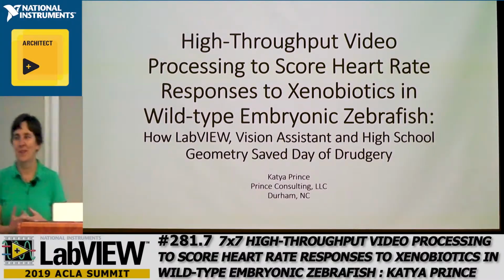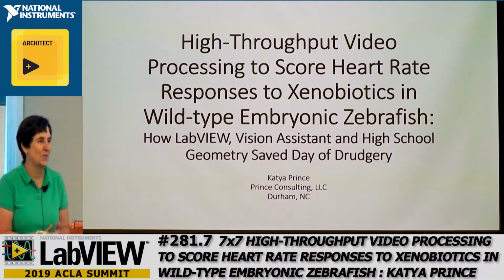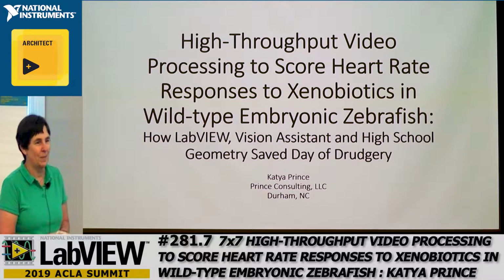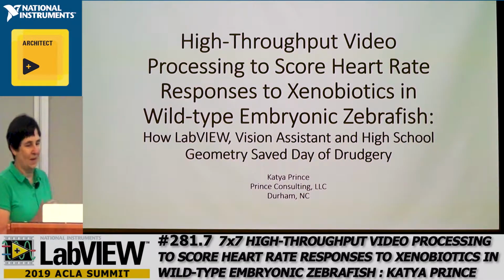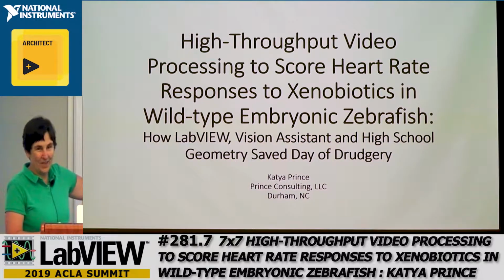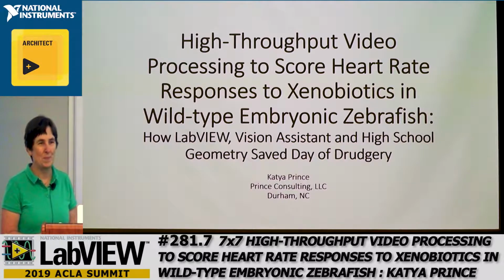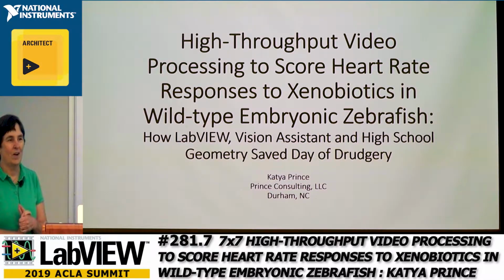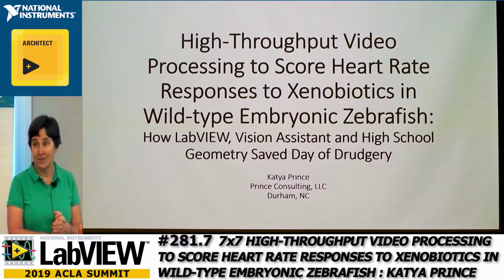Okay, so this is going to be something completely different from everything that we heard. This is actually going to be another example application that I put together. I work for the EPA from the toxicology department. This is a big, long title. This was actually the title of the paper that came out of this. But bottom line, what we're doing is we are measuring the heart rate of embryonic zebrafish.